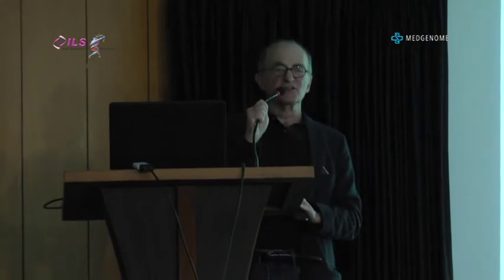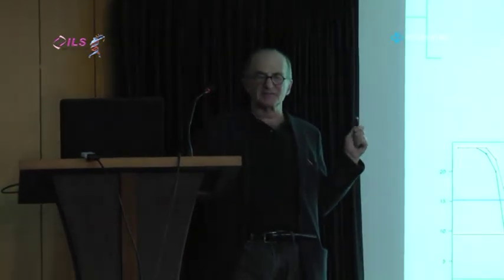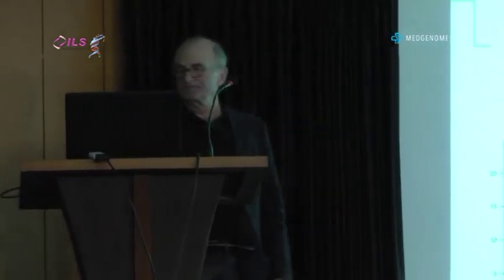This is in genome DNA? Excuse me? This is done in genome DNA? This is actually done on human genomic DNA, yeah. These are actually nuclear markers in a complex assay I'm about to show you, yeah.